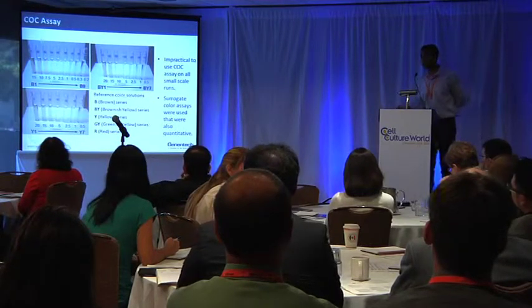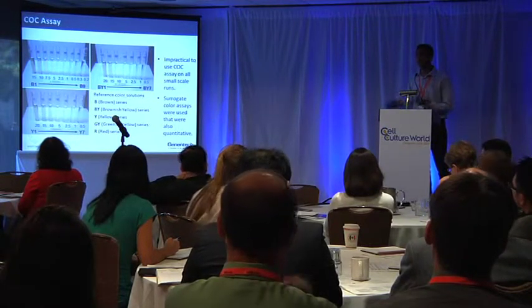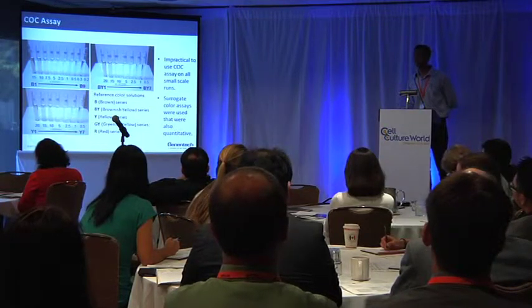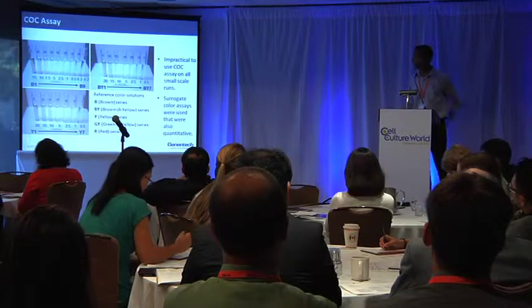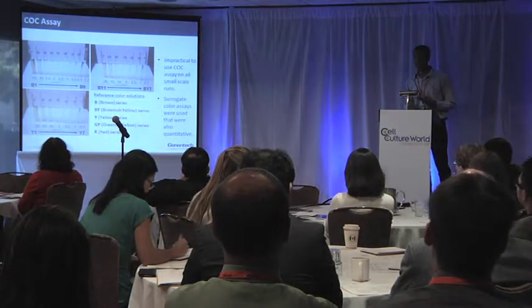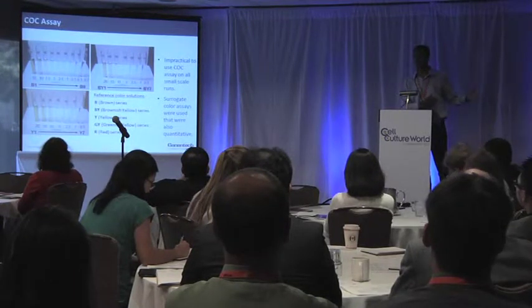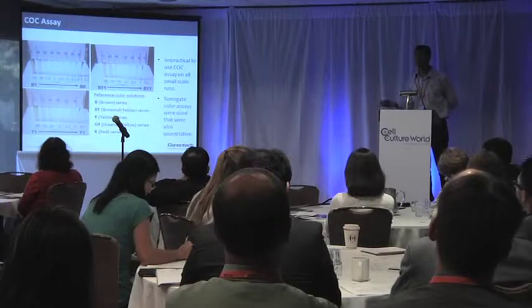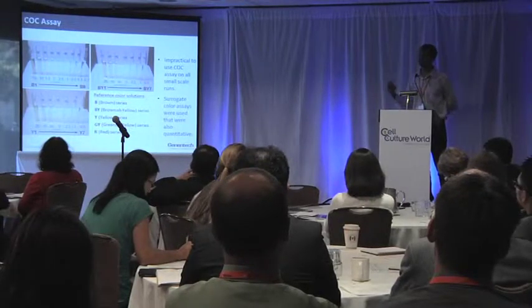However, this is always done on the bulk formulation, and especially for higher concentration formulations, it is impractical to use it for small scale studies, which is where we do most of our process development, either because we don't generate enough material, or that we need a lot of resources to process all our small scale material all the way down to the final formulated bulk. So we first had to develop a surrogate assay to test for color.